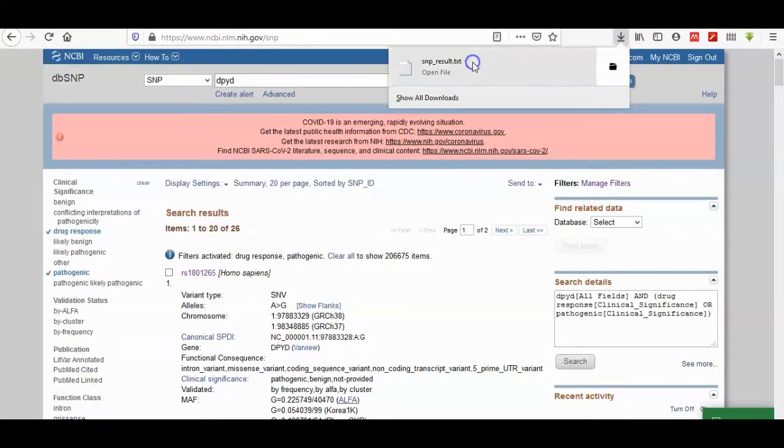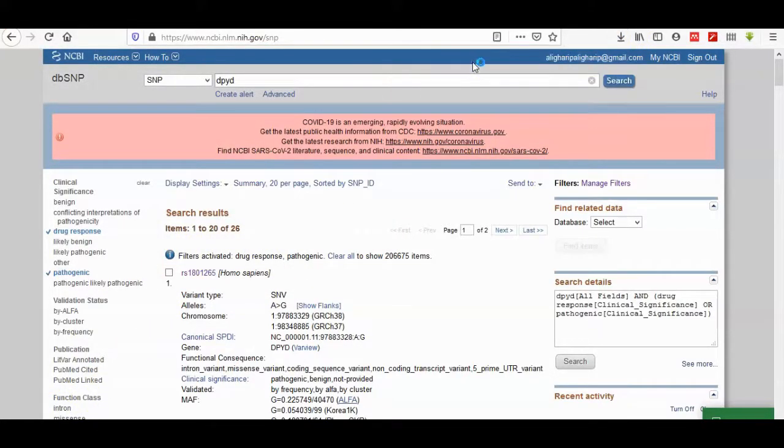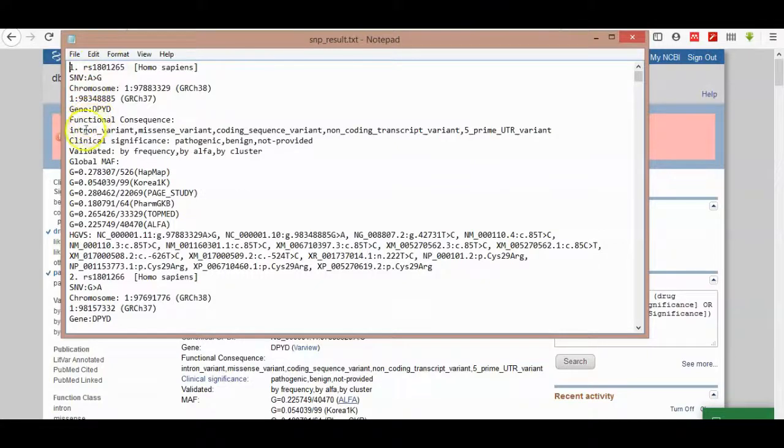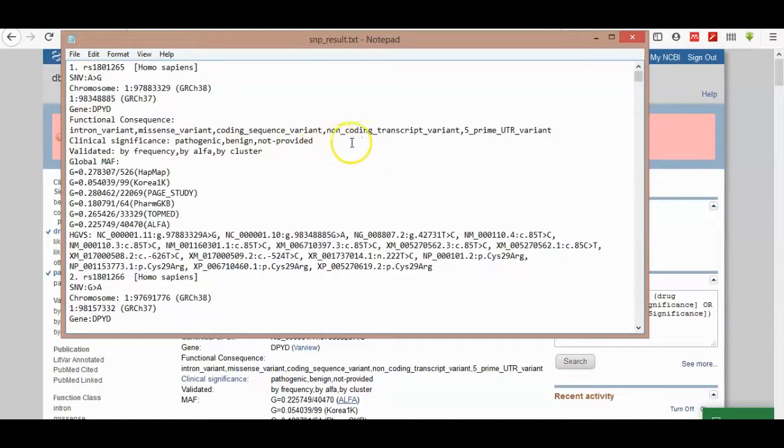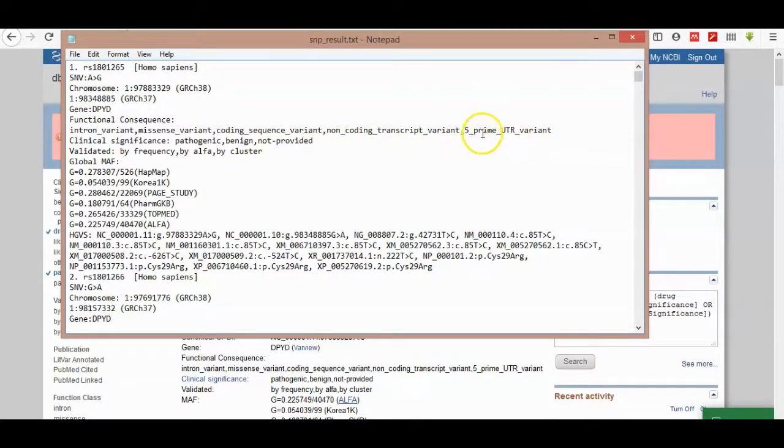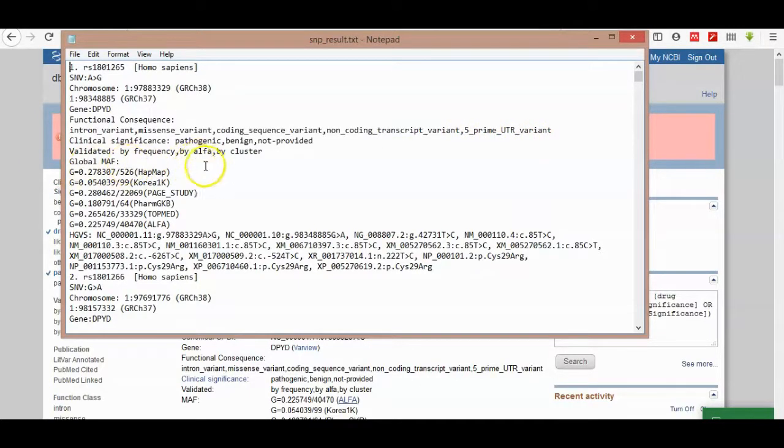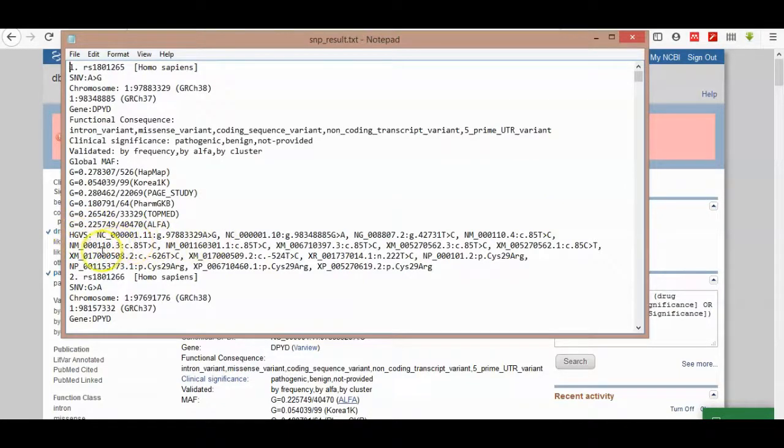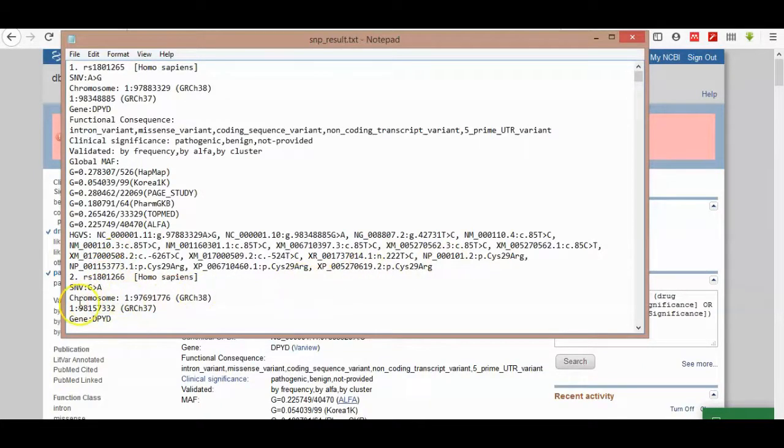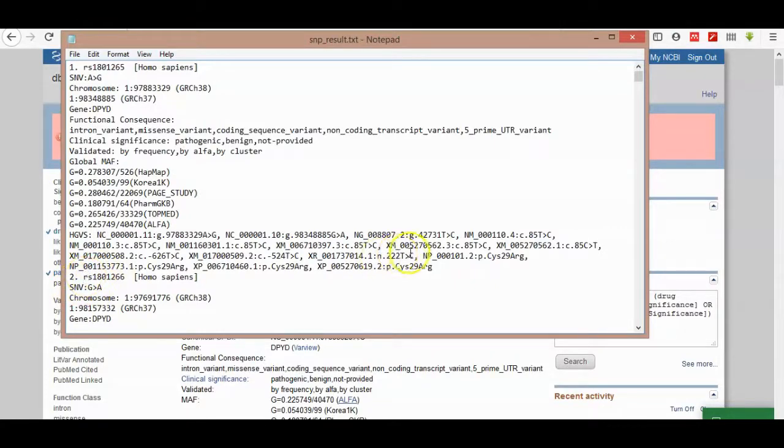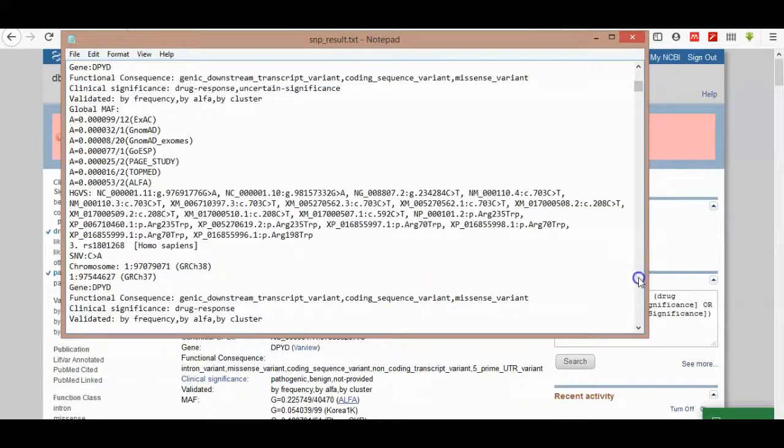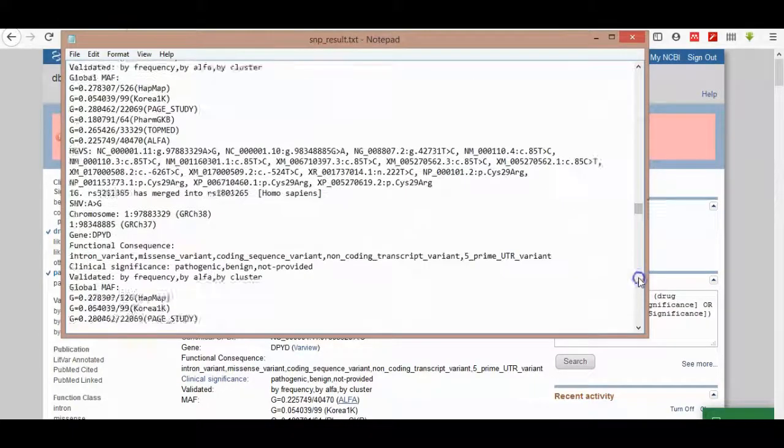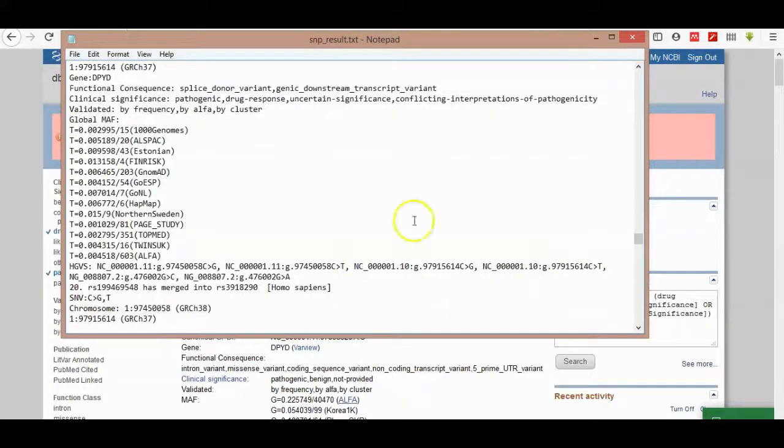I'm saving chromosome and gene function, corner sequence, variants - missense variant, coding sequence variant, non-coding transcript variant, five prime UTR, and translate region, validation by frequency, by alpha, by cluster. Here is the other name of these SNPs in other databases. You can choose it manually but it's tedious work to choose it manually one by one.